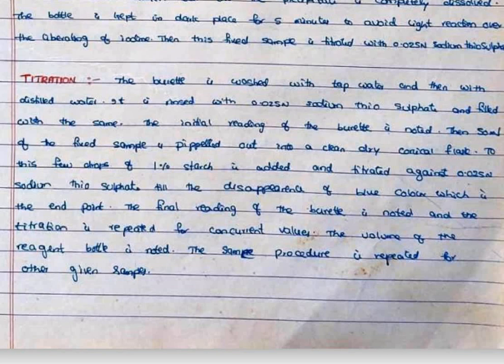The initial reading of the burette is noted.